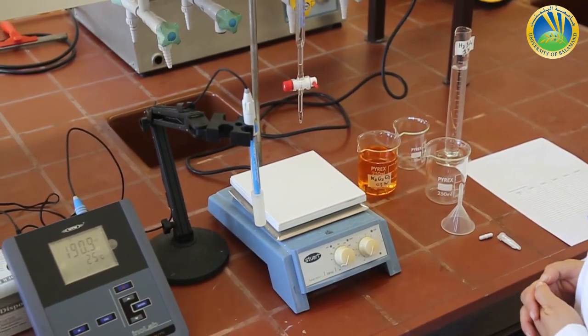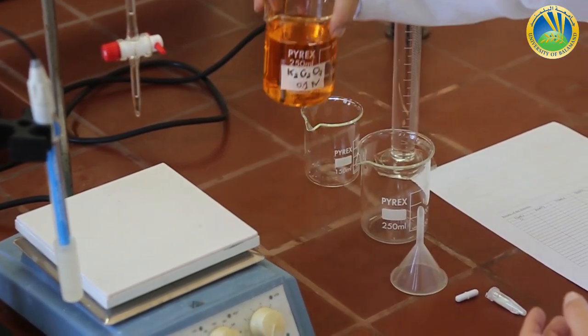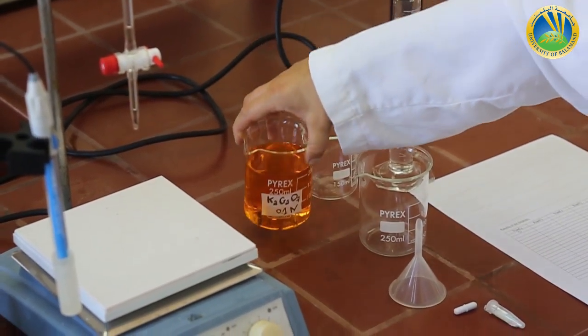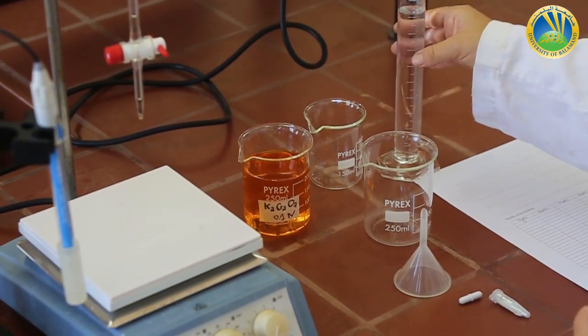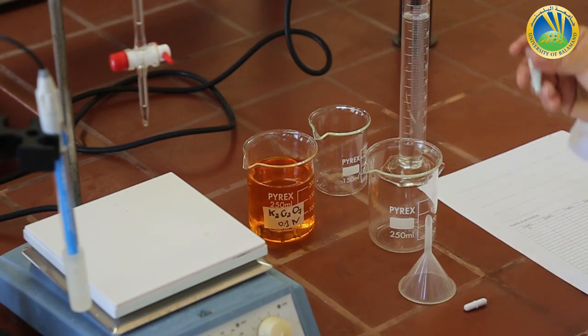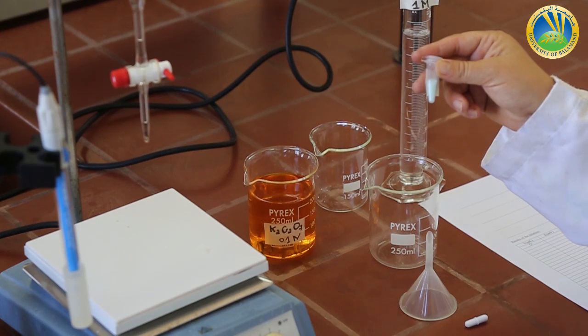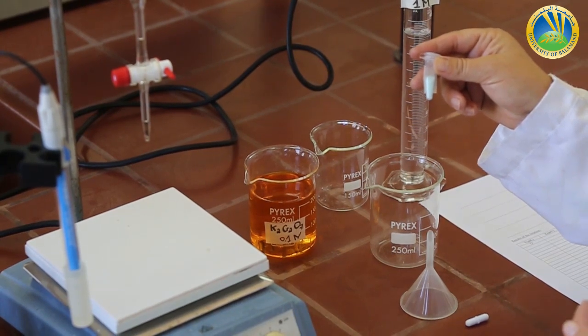Hi, Chem203 students. We are going to perform today the oxidation-reduction potentiometric titration, which is experiment number six. All chemicals that we are going to use are well prepared: K2Cr2O7 0.1 normal, H2SO4 1 molar 90 milliliter, and a well-weighed solid crystals of FeSO4 hepta-hydrated, which is 7H2O.